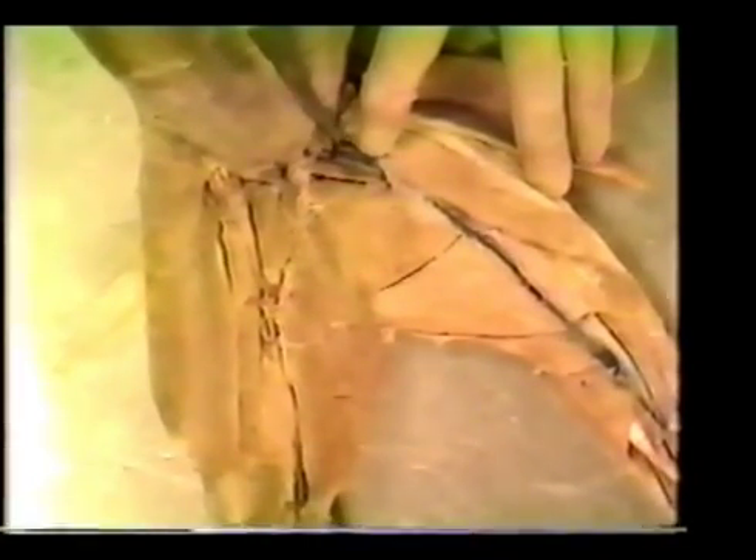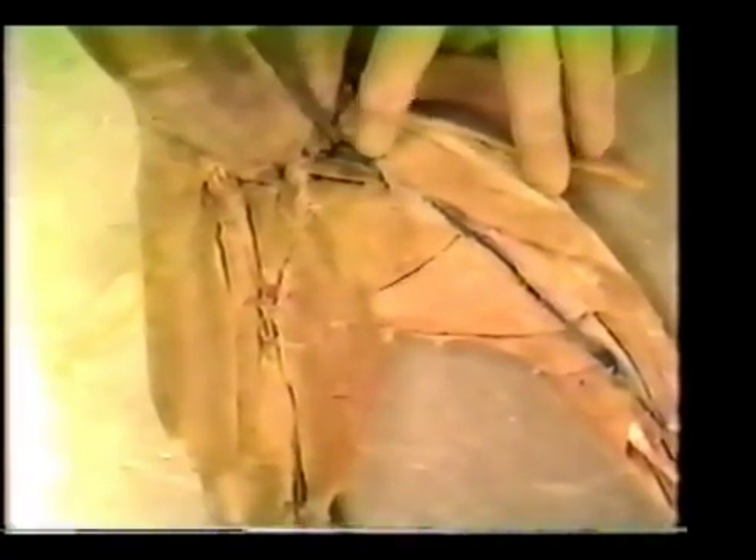To observe the next group of muscles, we will lift the gracilis aside. The first muscle, which is right next to the blood vessel, is a small muscle called the pectineus. Its origin is the pubis. It inserts on the femur and its actions are to flex, adduct, and rotate the thigh.